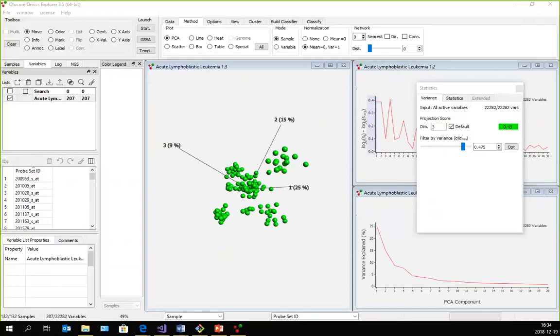Oh, someone asked me a question here. Sorry. Let's see here. The question is, what is the number 3 in the dimension referred to? Oh, right, this one here. That's a good question. I didn't bring that up. There's a lot more detail about this in the reference manual, but I'll tell you about this. This here is by default 3.